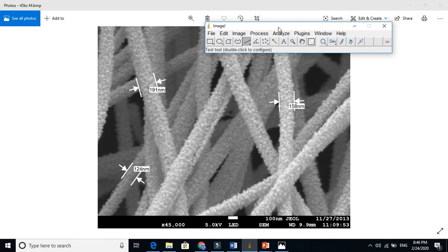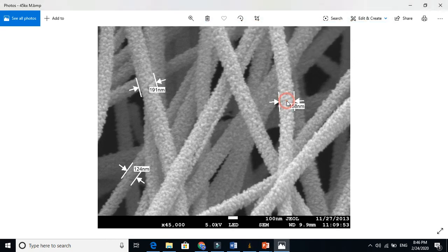Let's check whether ImageJ can give the correct reading or not. This is also another way: if you look at this scale here, this is 100 nanometers. Take the similarity and comparison, and you can easily guess what is the size of this nano fiber. So if you compare this scale bar with the fiber, it is almost 158 nanometers or something like that. This is another way to measure.